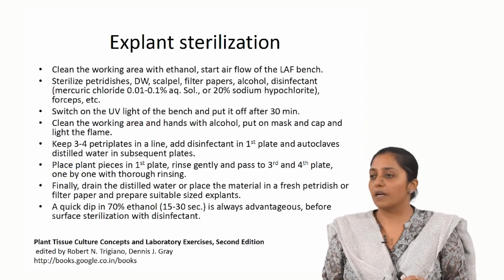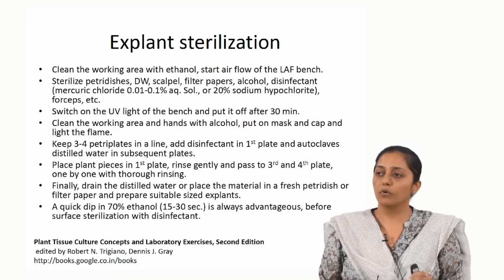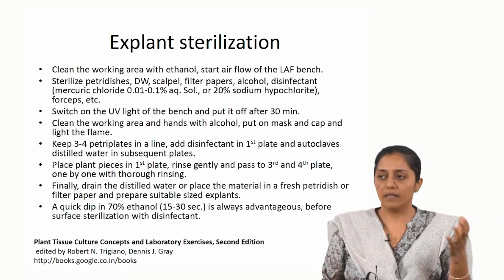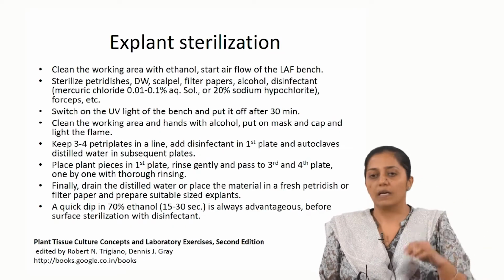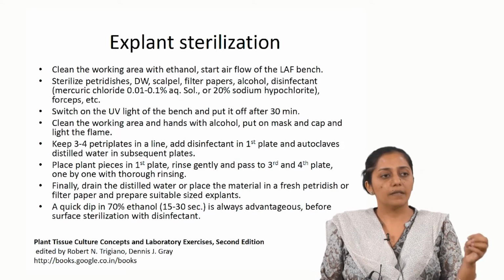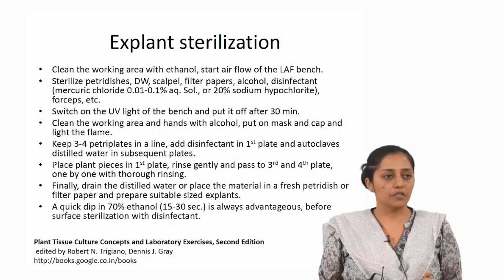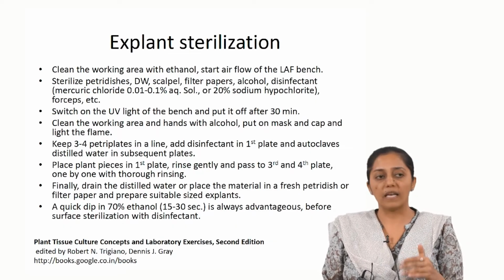So, how is explant sterilization done? This is from a Google book where a simple protocol is given. Generally, you bring the plant material from outside and give a continuous water wash, and then a 2% Savlon wash can also be given along with water. After that you treat it with distilled water to remove the detergent, and then you take it into the laminar hood.